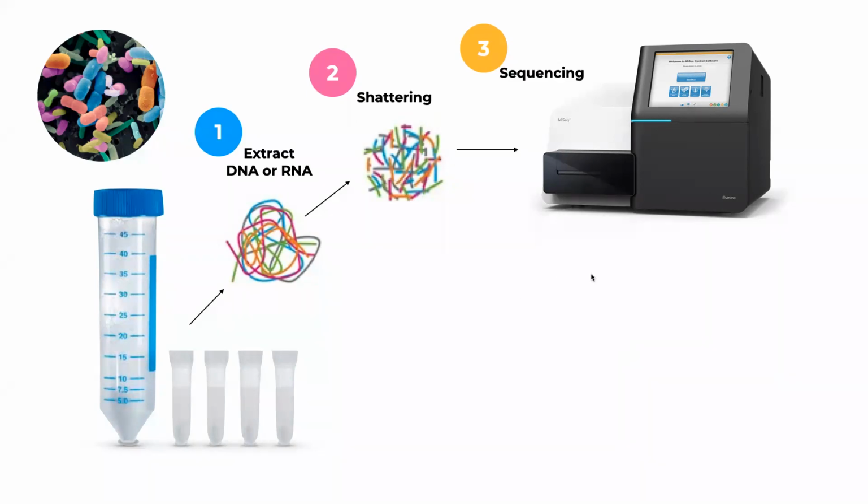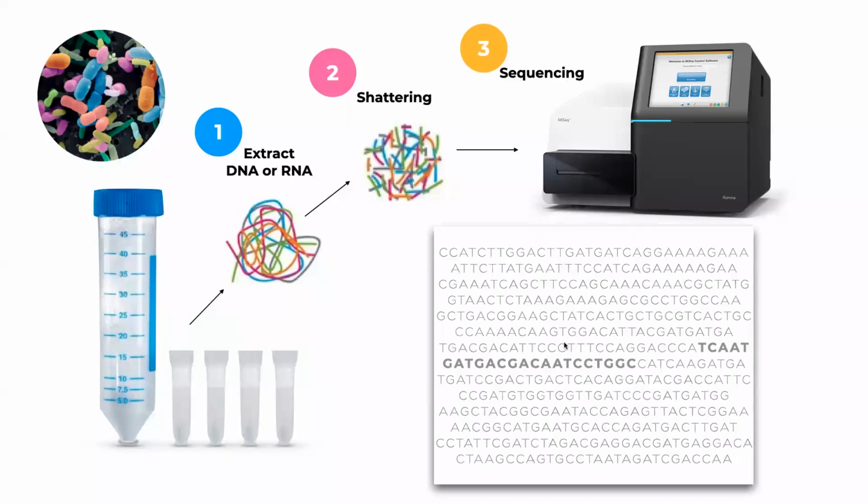For example, they could be sequences that we can map to a reference genome, to a known organism, or we can combine them into groups that are similar to each other. And so these are the two main approaches of sequencing, and they will have a huge impact on how we look at the data and what we can study with that data.